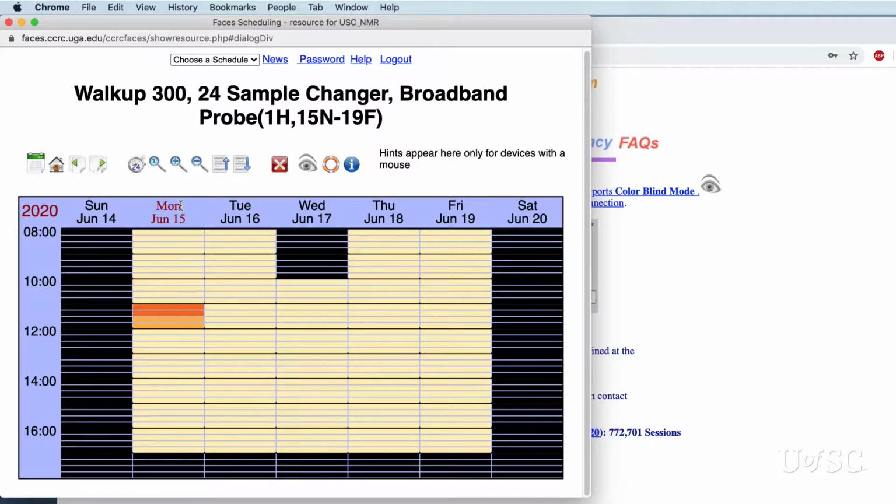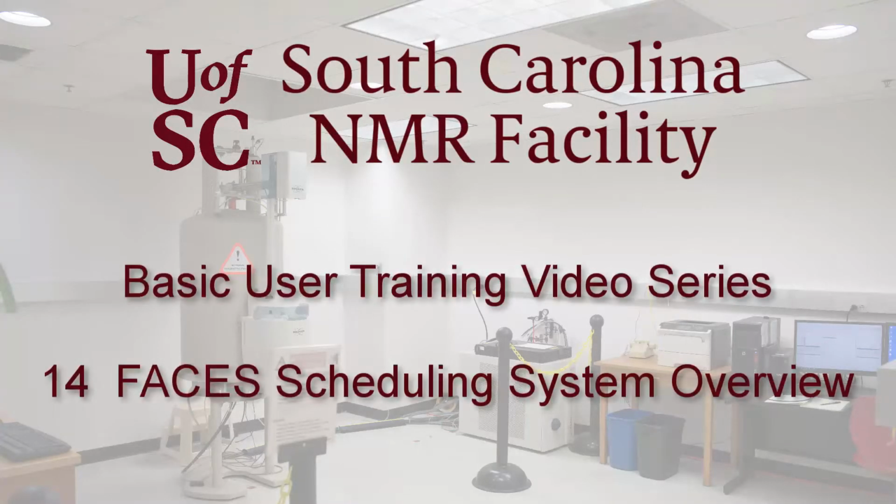This has been a brief overview of the Faces scheduling website. Please refer to the manual for more details and ask the staff if you have any questions.